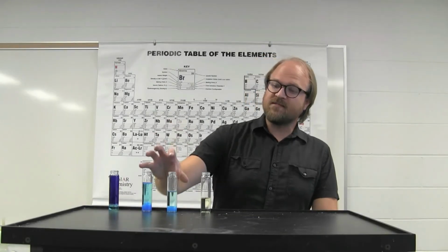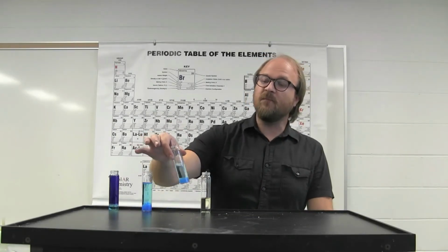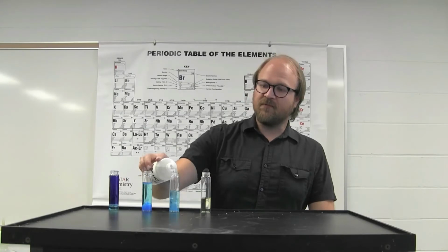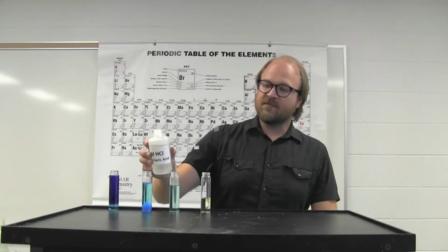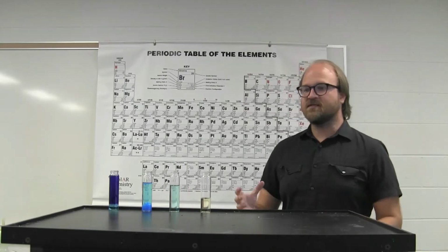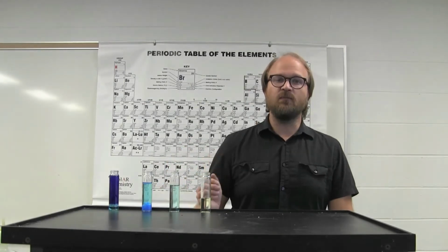However, it's these reactions, looking at the formation and the dissolving of a solid, that we're going to focus on in this experiment. Solids can either be formed in a reaction or they can dissolve in a reaction. And this experiment focuses on the ability of solutions to form solids, form precipitates, and the solubility of the solid itself.